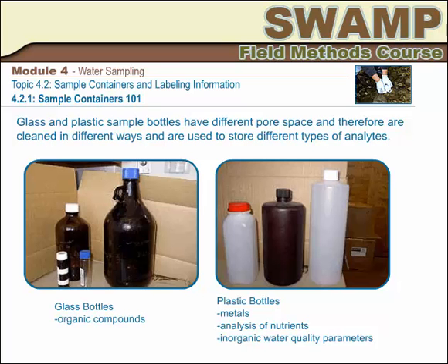Usually, the analytical laboratory will provide you with the appropriate pre-cleaned container, but you will need to get specific details on how to fill each one. Please refer to Appendix D of the SWAMP Quality Assurance Management Plan for information on matching container types to your analytes.